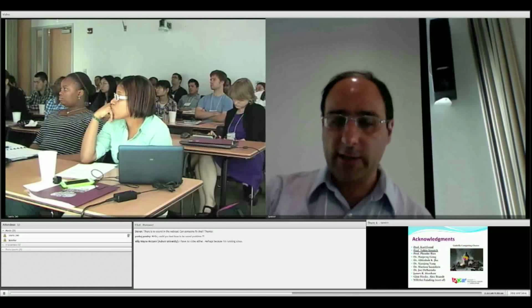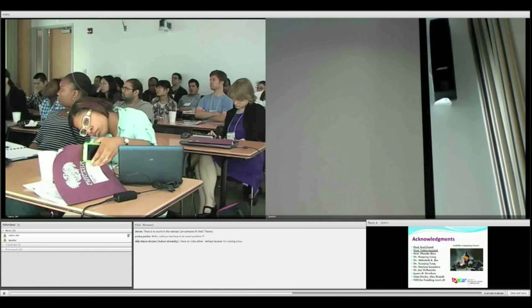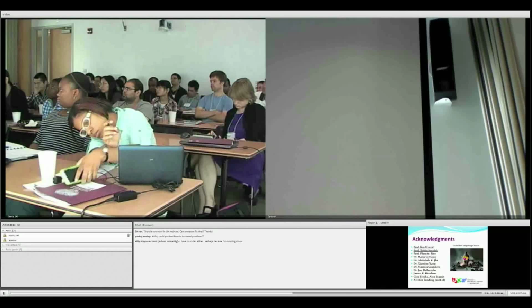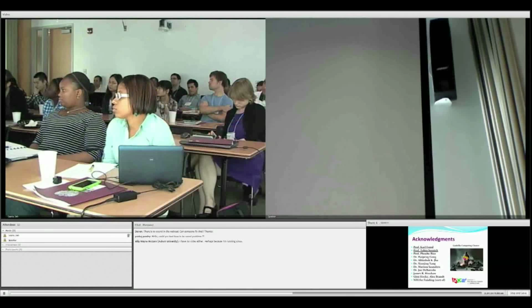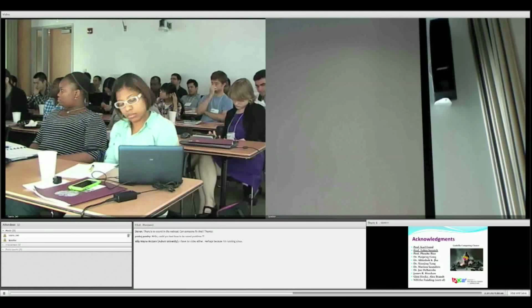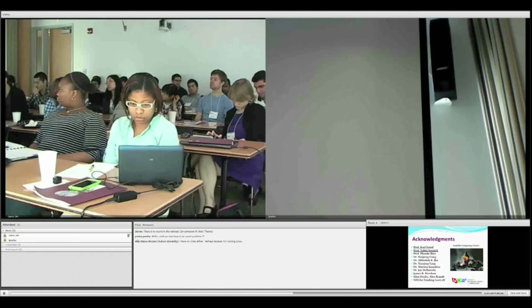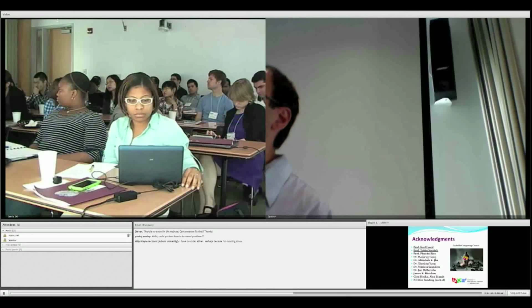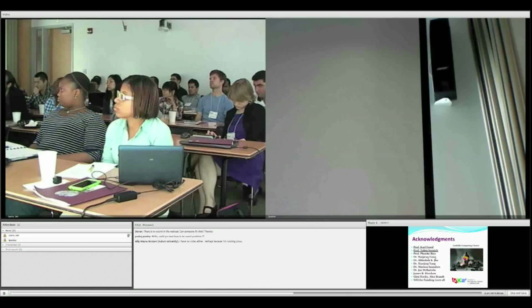To conclude, TOP identifies and improves the torsional angles, increases the number of hydrogen bonds, and generally lowers the R factors, and it requires only a backbone trace. So this is applicable to NMR and cryo-EM. Even if you want to build a homology model, this can be used to improve your model. It saves time in manual refinement, and if there is a missing portion, this can optimize the portion you build into your structure.